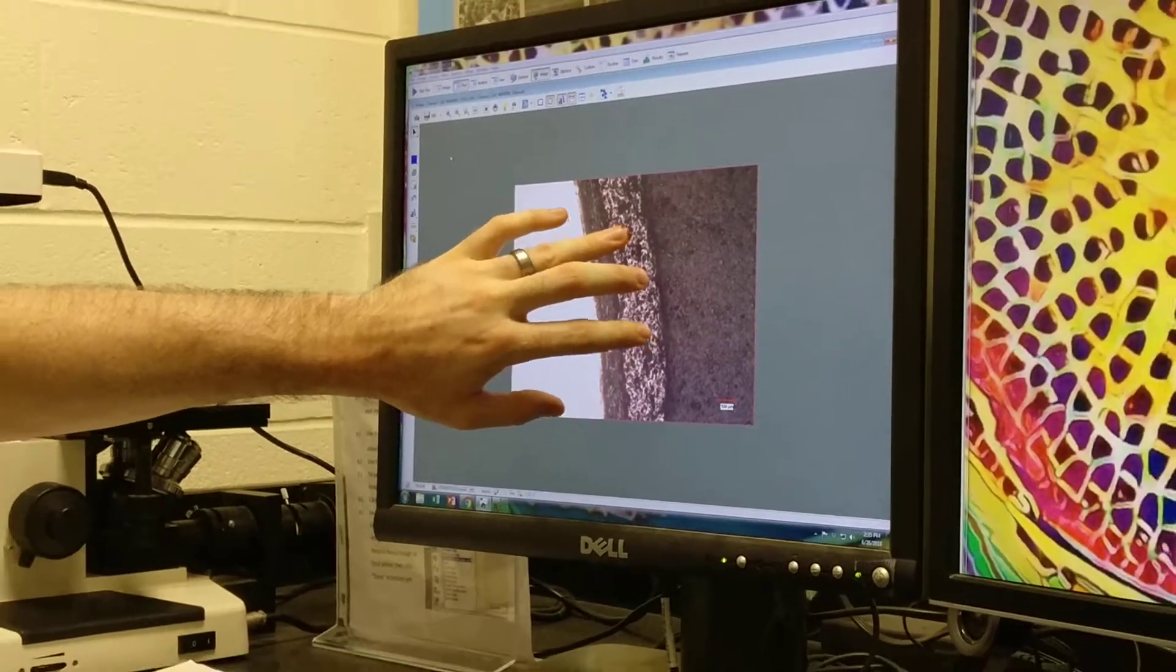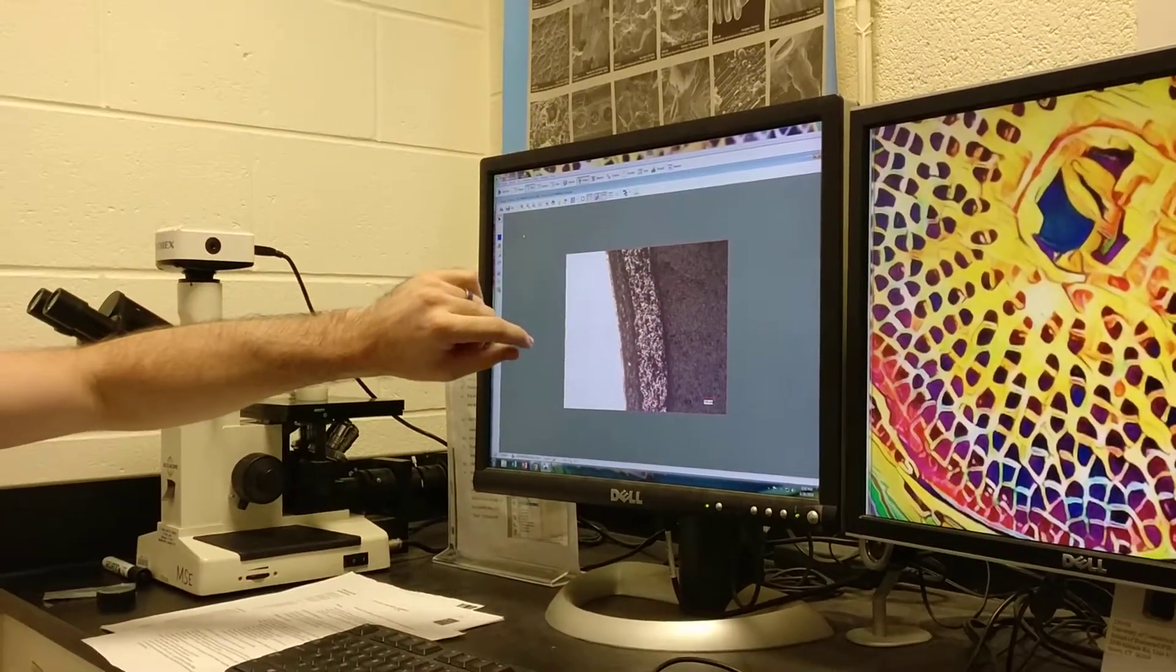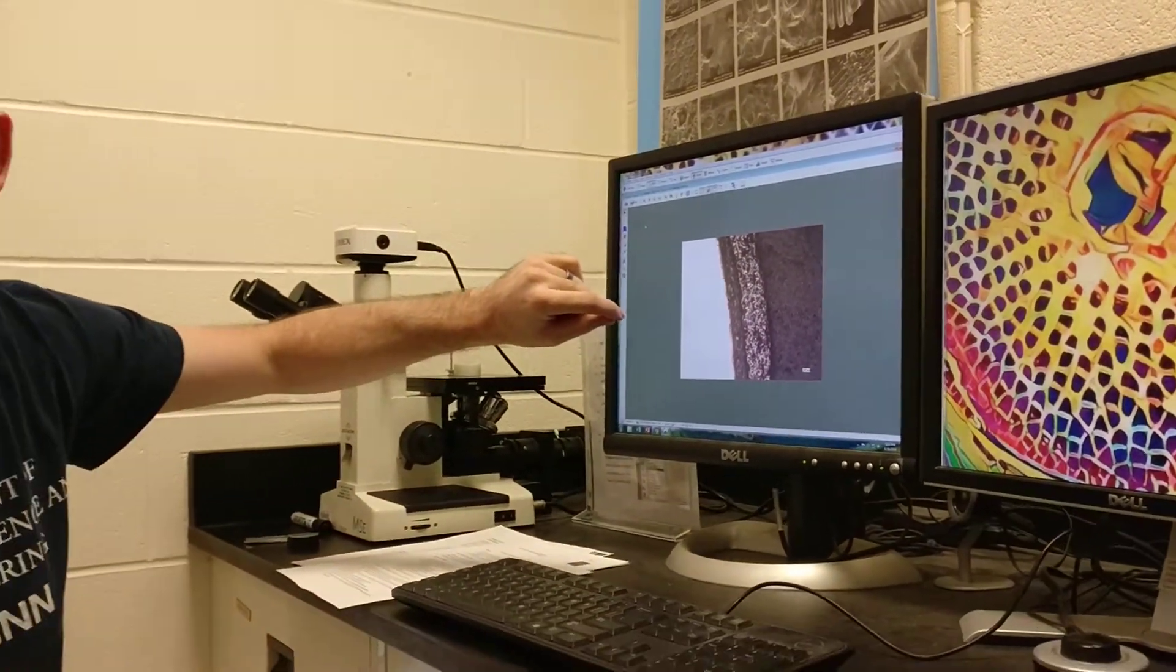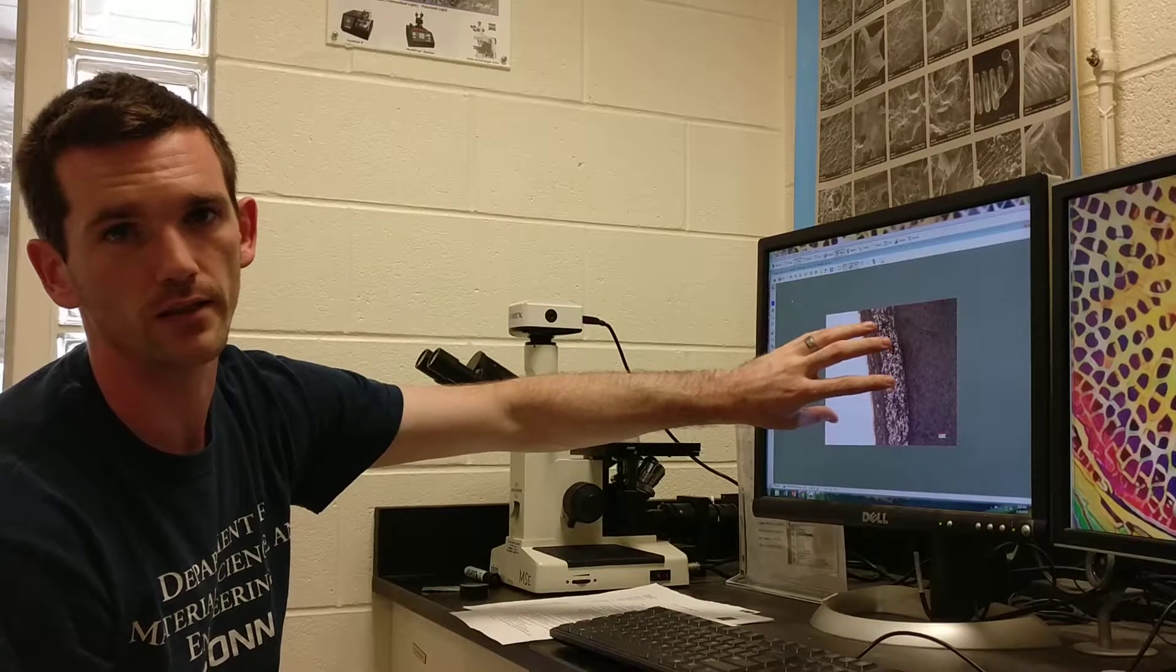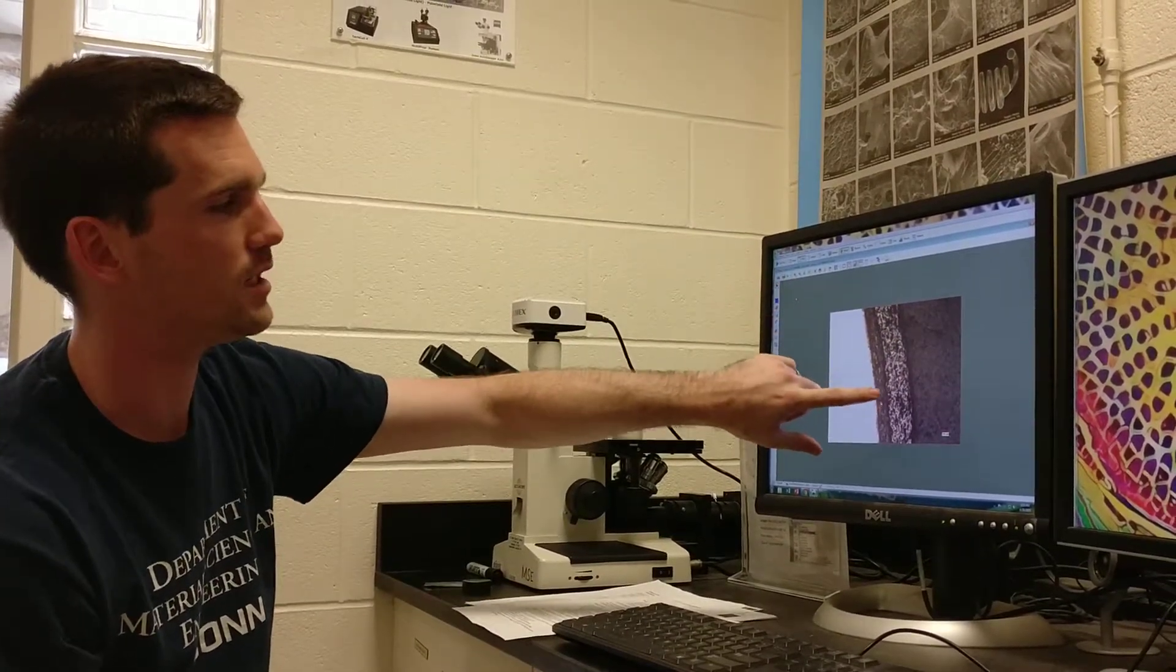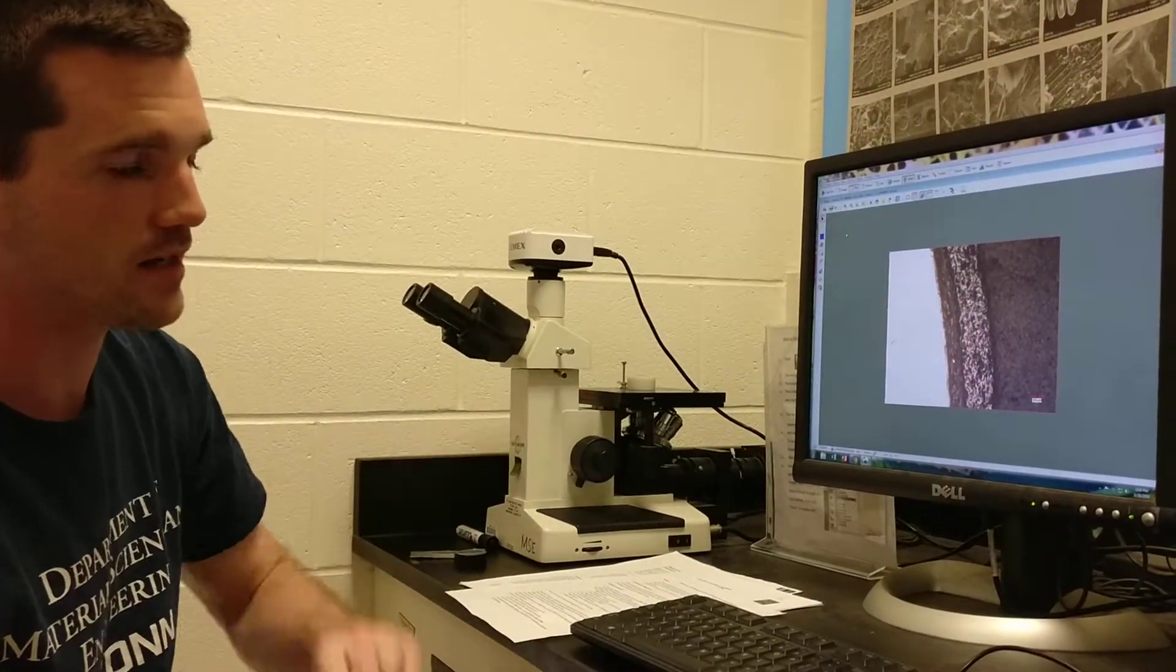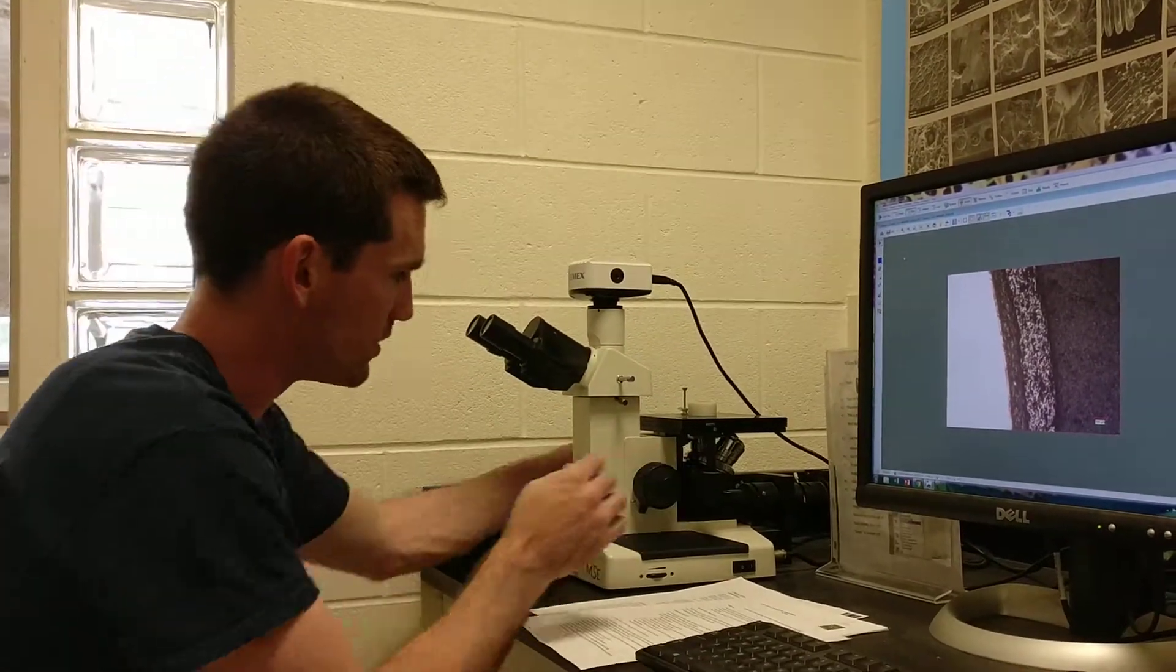This is made of yttria stabilized zirconia or YSZ. The main principle is that we have a metal bonded to a ceramic. The ceramic is used for low thermal conductivity but it will expand at a different rate than metal when it heats up. We need an intermediary layer to promote the adhesion of that thermal barrier coating, and in this lab we are going to measure the thicknesses of both coatings and quantify the porosity.